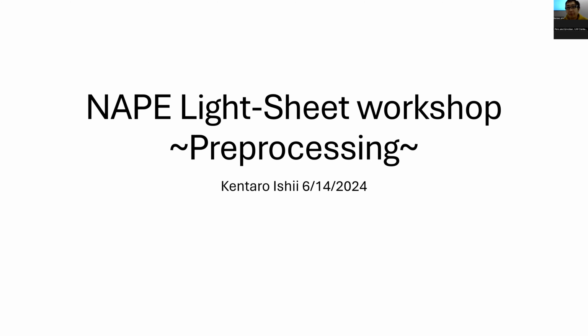There you go. Okay. So as Luzine said, I'm a postdoc in the lab, and I've been working on the Lightsheet microscope for a good amount of time. I've been clearing a lot of brains for the past couple of years. And for me, the biggest struggle was actually this pre-processing part. Thanks to everybody in the field and thanks to LifeCanvas, the clearing is actually so easy. You just put the brains into solutions and you get the brain out. It gets remarkably transparent.